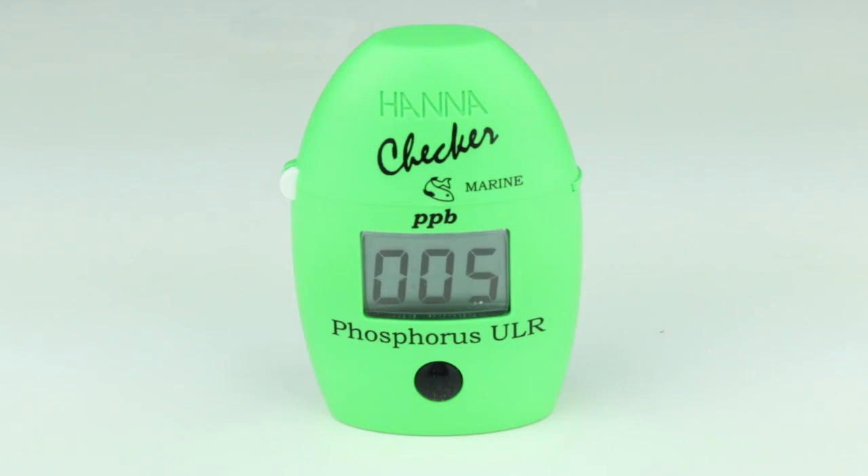Once the timer reaches zero, the meter will display the concentration of phosphorus in parts per billion. Once the measurement is finished, dispose of your sample in accordance with local regulations.